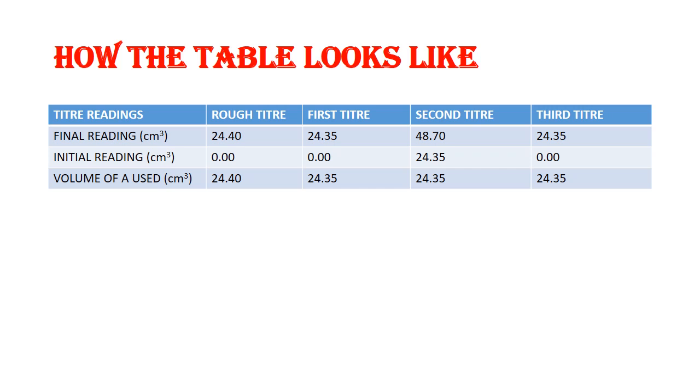Okay, by then the acid in the container would have been exhausted. It would have been exhausted before the color will even think of changing again. Do you understand? Because the total volume for the burette is 50 centimeter cube. So because of that, when it is less than 25, it is advisable to continue from there, because before it will change again, it will be 40 something.